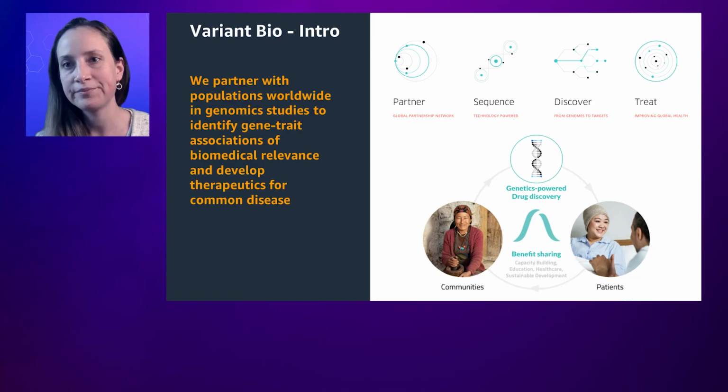Thank you for giving us the opportunity to speak today and to share a bit of Variant Bio's work, namely how we use mid-pass whole genome sequencing to enable biomedical genomic studies of diverse populations.